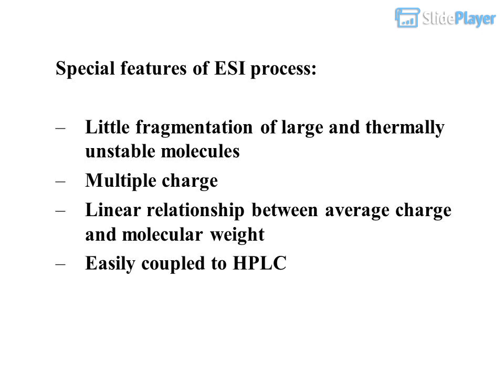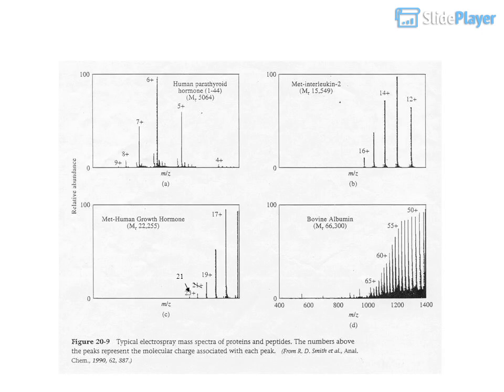Special features of the ESI process. Little fragmentation of large and thermally unstable molecules. Multiple charge. Linear relationship between average charge and molecular weight. Easily coupled to HPLC.